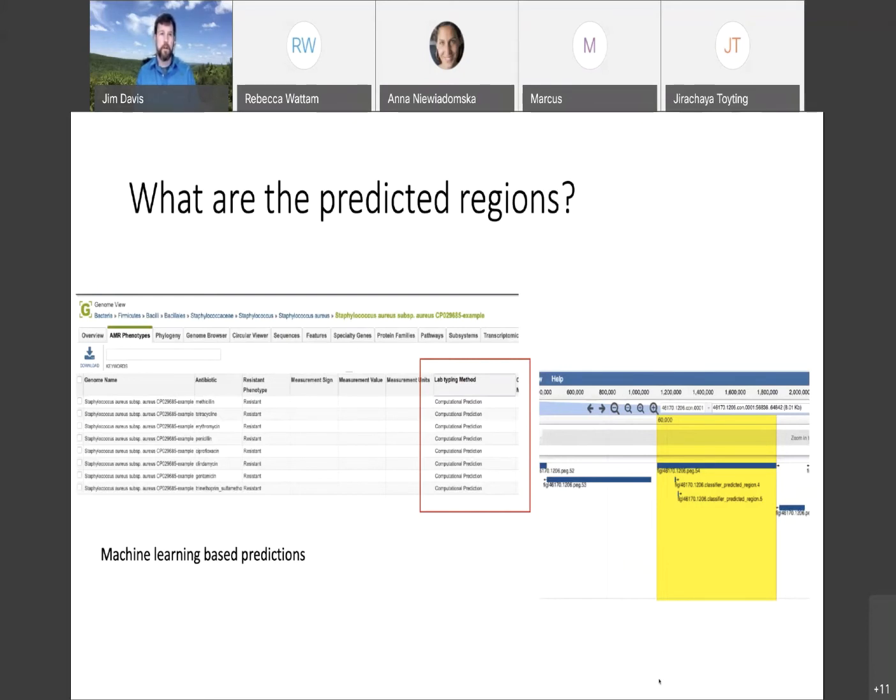Then over on the PATRIC side, I'm not sure if you get specialty genes over at RAST or not. There's a couple of things that are done on the PATRIC side that enable us to look at that genome against PATRIC. So the short answer is that they're almost identical.